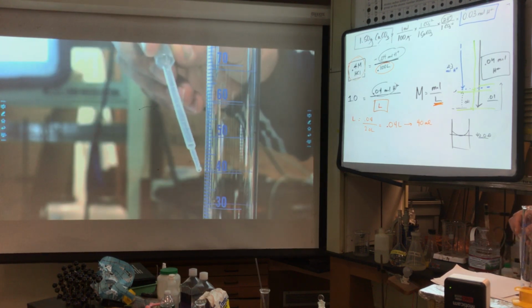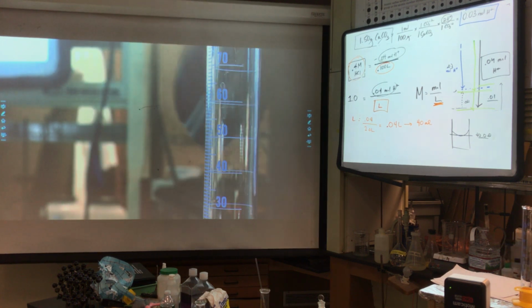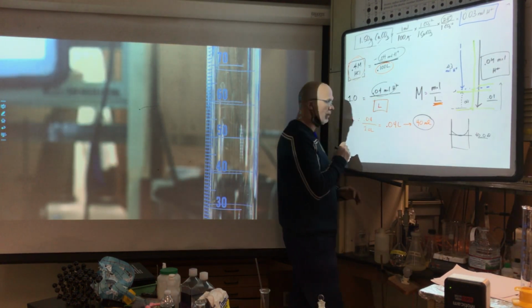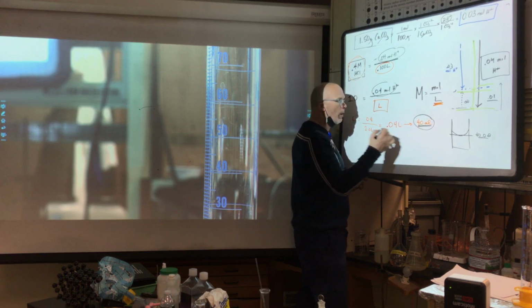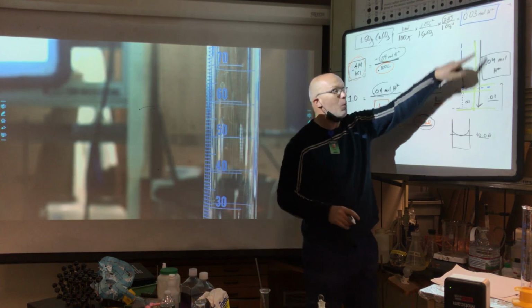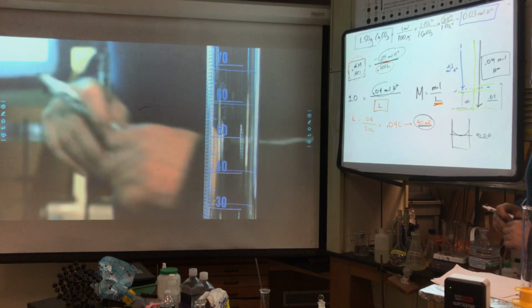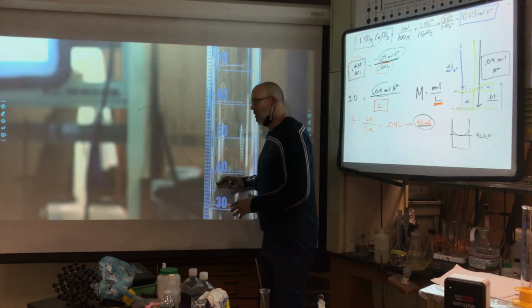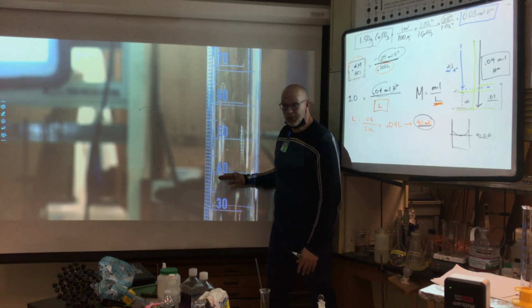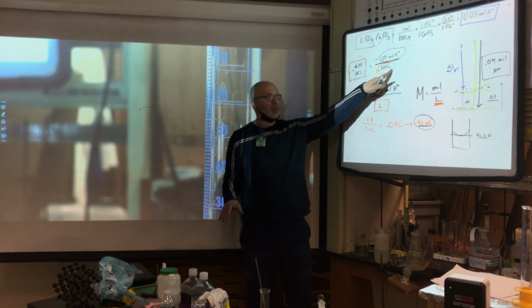I'm going to spend a good amount of time at eye level to get this exactly at 40 milliliters. I have to make sure I have exactly 40 milliliters of it, because 40 milliliters of the 1.0 molar is exactly 0.04 moles. That's what I'm trying to deliver, so I've got to spend the time. Once I have 40 milliliters, what do I do with it? Because the 40 milliliters of 1 molar is still 1.0 molar. What am I trying to make? 100 milliliters of it.